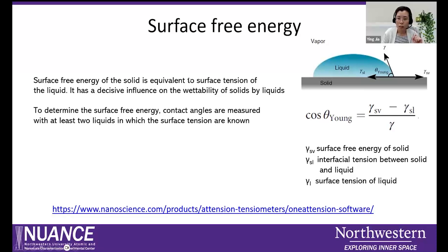If you ever optimize a coating process, or coating layers of film, surface free energy plays a very important role, for example in drugs, or in car windshield coating, or other functional materials. This parameter is a decisive parameter for the wettability of the solid.